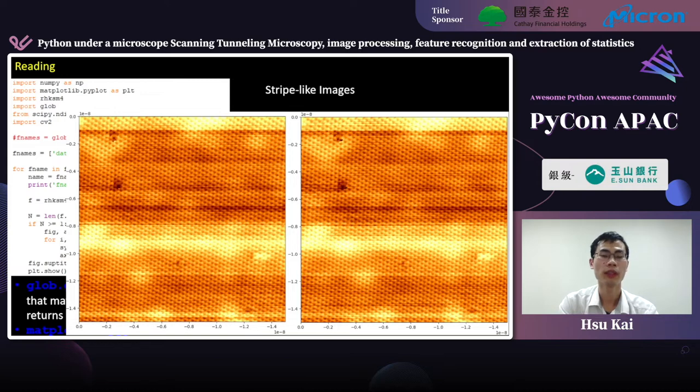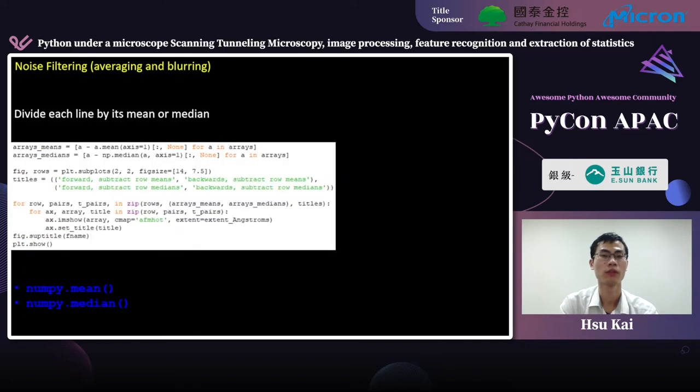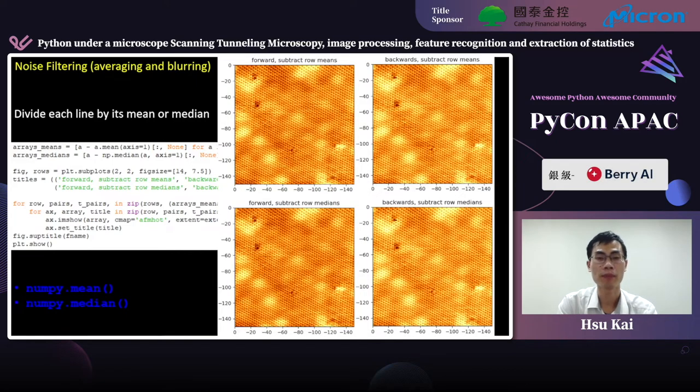So, a simple and common way to address this issue is to apply mean or median subtraction. Here, I use NumPy mean and NumPy median to offset those stripes. NumPy mean and NumPy median compute the average and median of the given data along the specified axis. So, after processing, as you can see, those stripes are clearly removed.